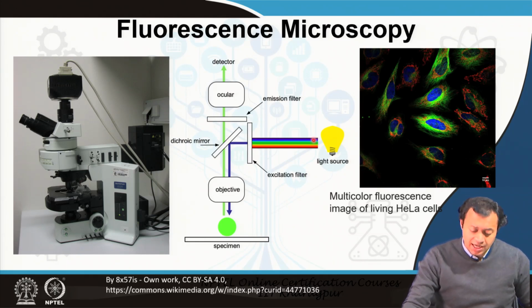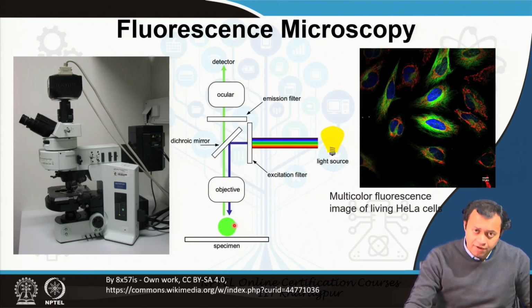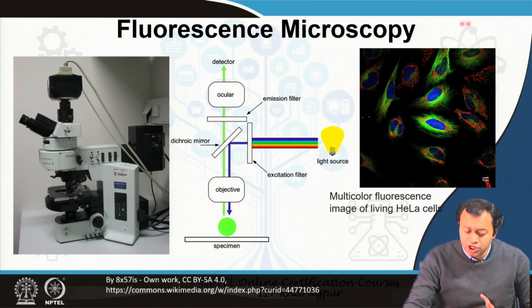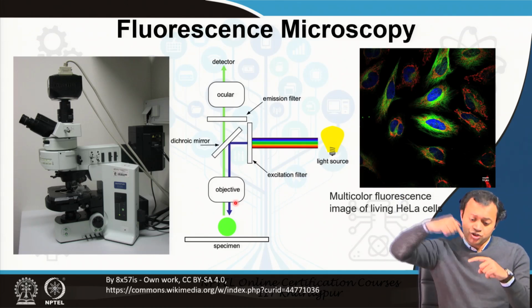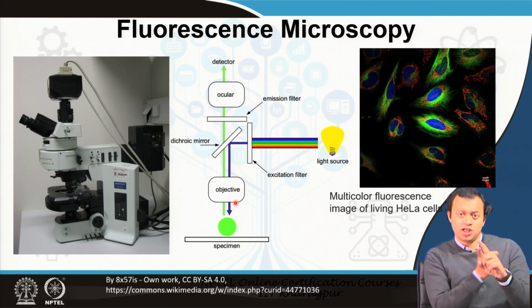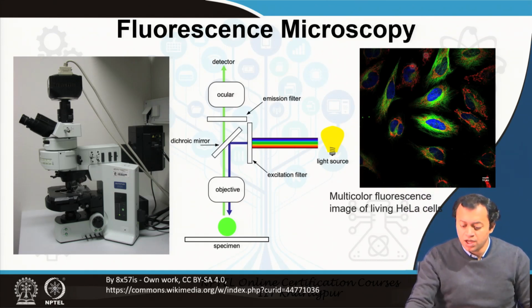We shine light either continuously or at specific periods of time. Pulse lasers can be used, different types of pulse lasers, and different types of fluorescence, red, green, blue, etc., can be done simultaneously or at different times. All of these permutations and combinations can be done. Nowadays, they are doing 3D emission, just like you saw in OCT, shining light from here, from here, from there. So, you get an overall 3-dimensional image of fluorescence.